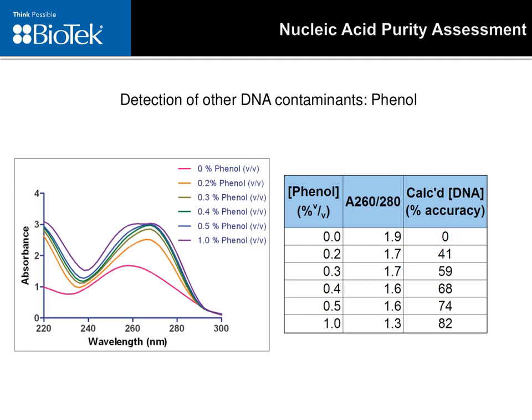There's a question regarding the Synergy Neo plate reader as far as hardware, particularly for measuring 4 microliters. Not necessarily, although some of our instruments have slightly different optics. Certainly the Synergy Neo is capable of measuring 4 microliters in a 384-well plate. Again, recall that these are special 384-well plates that are a little smaller in diameter, essentially in area.